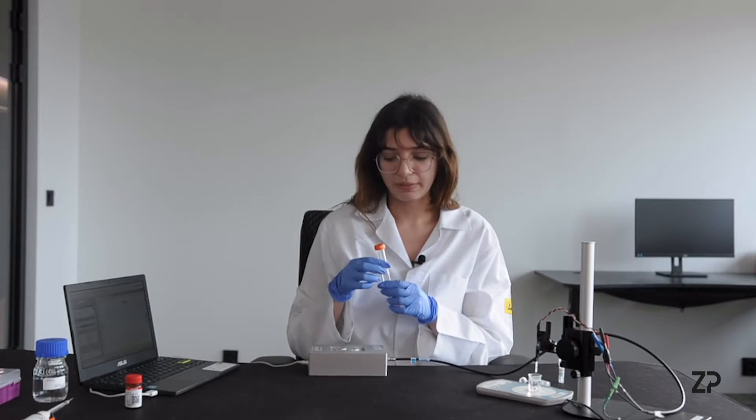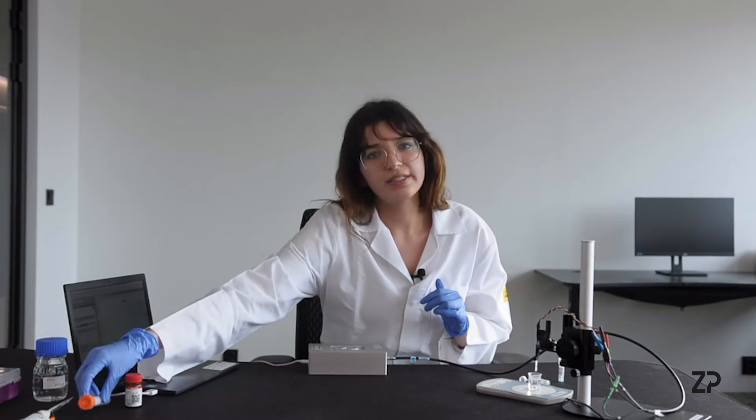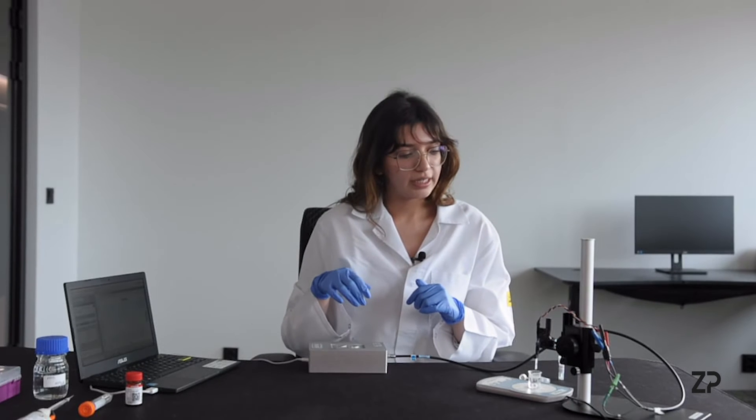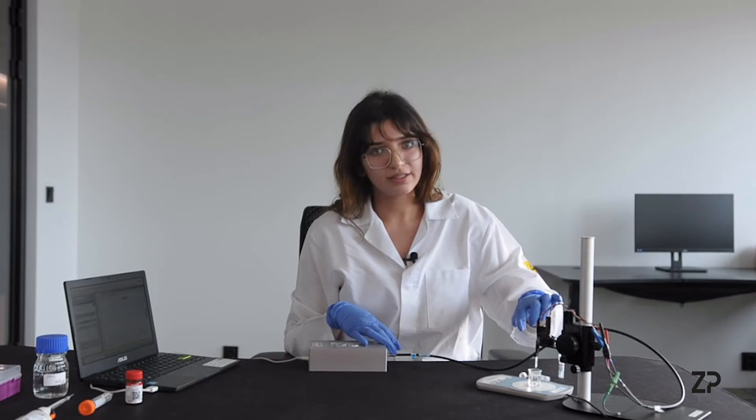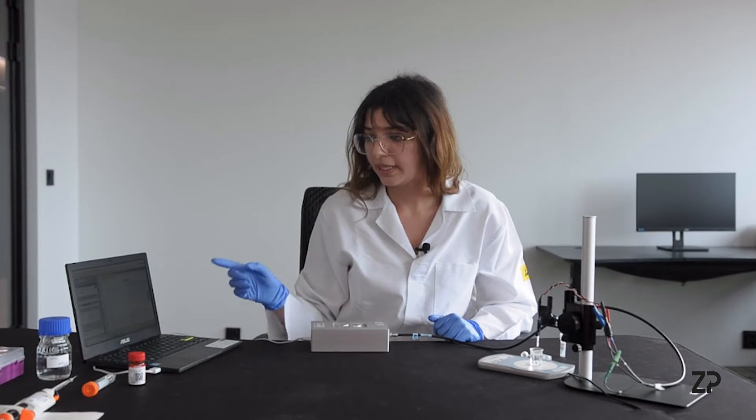It's important to stress that we use lactic acid and not sodium lactate for this experiment, otherwise it won't work. You also need the Anapot connected to a connector, and software to run this — we're using PS Trace.